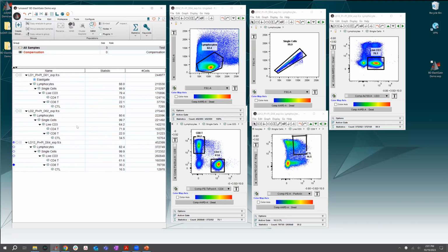Now that I think about it, you have to pick the training sample to train it on. So I'm not really sure if you would want to templatize it across workspaces, if you don't have that same template sample in there. So also a good question. I imagine you could make that node group owned and then make that into a template. But I'd probably be more inclined to just run it anew in the workspace, now having a new training sample to run it on.